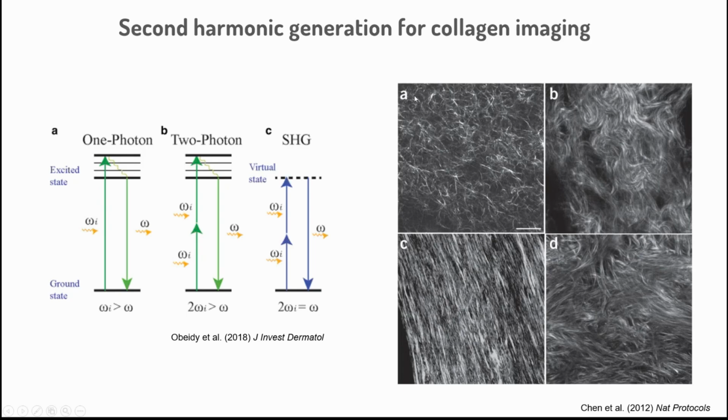This only happens, I think I put it here, in highly organized structures like myelin, or actually, myelin is not proved yet. It's something that we're trying to do, but in very organized structures like the collagen matrix, which this is not in brain tissue. I think this is skin, but in very organized tissue structures like collagen, the two photons will rebound against the tissue and create a harmonic, like in the guitar, for example.